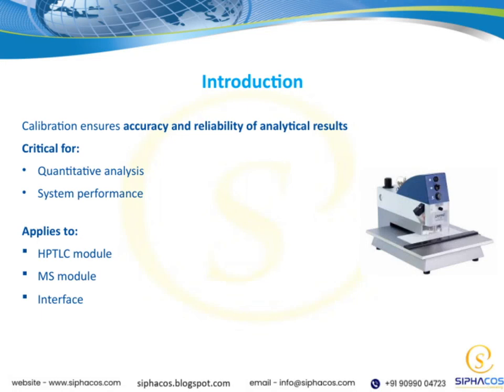Calibration is a crucial step in our analytical process because it helps ensure that our results are both accurate and reliable. When we calibrate our instruments properly, we can trust that the data we obtain truly reflects the sample we're analyzing. This is especially important for quantitative analysis, where precise measurements are essential. It also plays a key role in maintaining overall system performance, preventing errors before they happen.